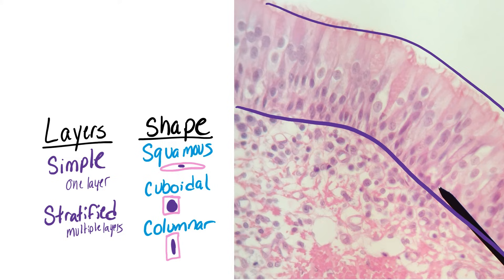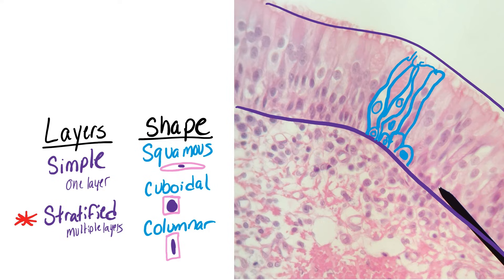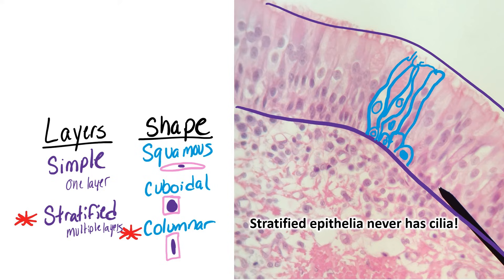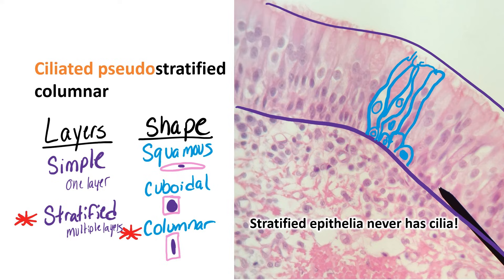In the epithelial layer, we do see multiple layers of cells, so this looks stratified. And if you look at the shape of the cells, you would say they are columns. However, look at the top — you see those cilia? You never see cilia in stratified epithelia. So this is kind of a trap: this is not actually stratified columnar. Because you see those cilia, you know that this is ciliated pseudostratified columnar. Pseudo means fake or false, so these are fake layers, because there are some short cells and some tall cells, but every cell is touching the basement membrane. To remember this, I think of it as hairy fake layers — ciliated pseudostratified.